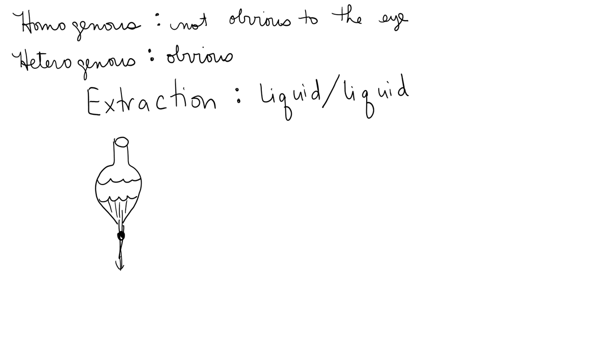You can't use extraction as a technique when you are separating a solid from a liquid. A lot of times I get students saying that they're going to use extraction to get a solid away from a liquid. It's really not what you're doing. What you're doing is using solubility, dissolving one kind of substance in the solvent, and then you're doing a decantation.